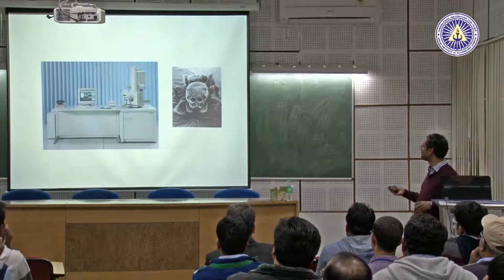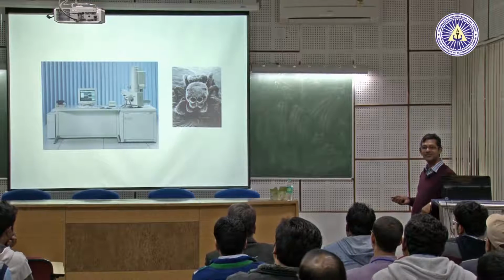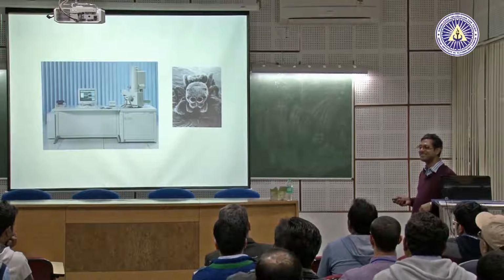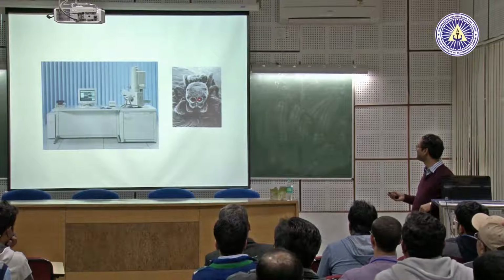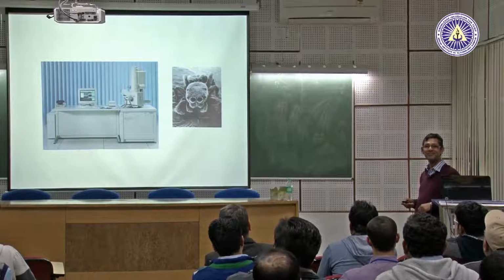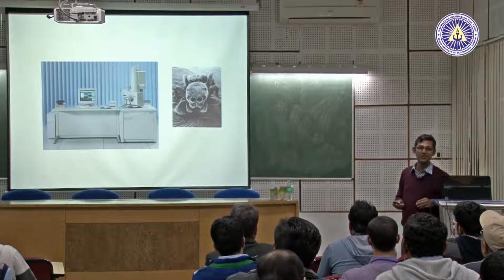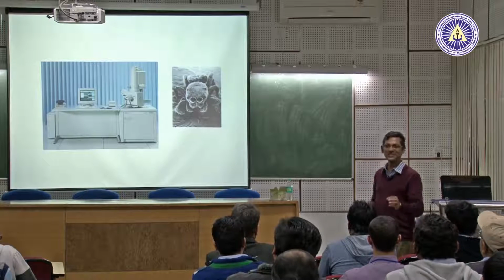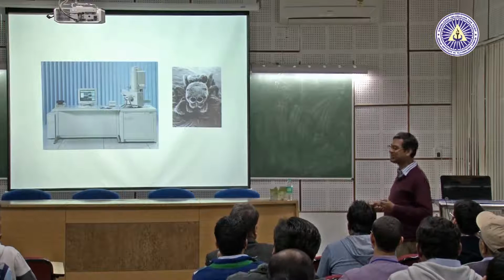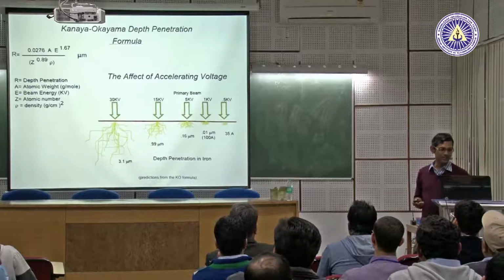This picture is a famous one. Everybody shows it in the lecture. This is what? A human skull. Yes, these are the eyes of a spider. Have you ever seen inside it? How many eyes do they have? Yes. So the first time you go to this SEM, this is the first sample your instructor will show you. Very easy to see, very easy to focus. Sometimes they show some insect, other insects also.